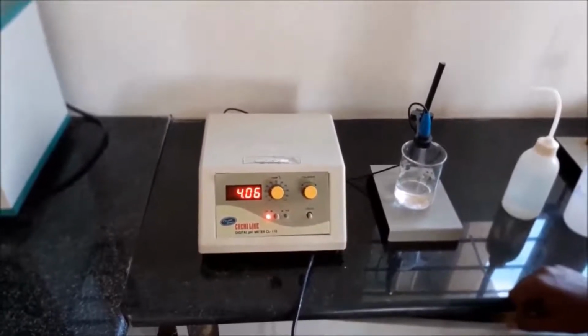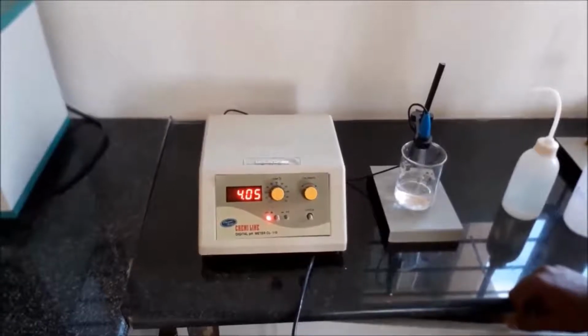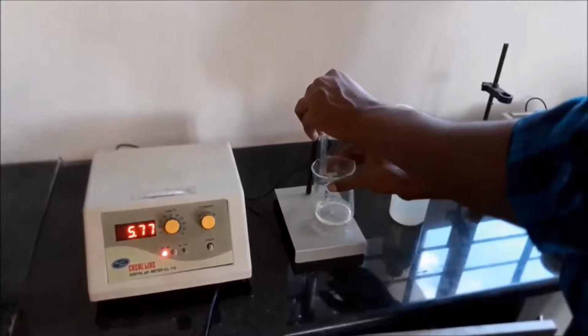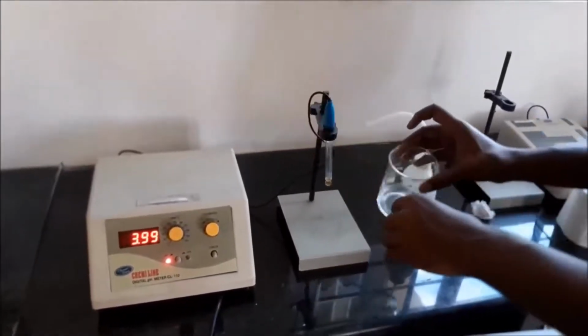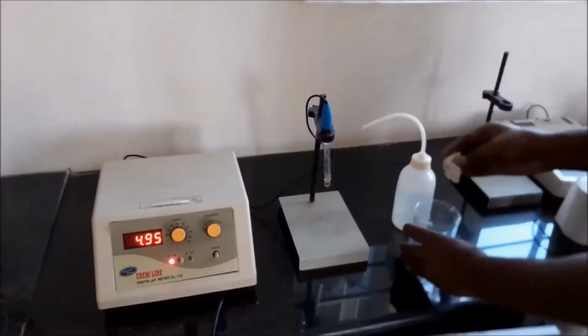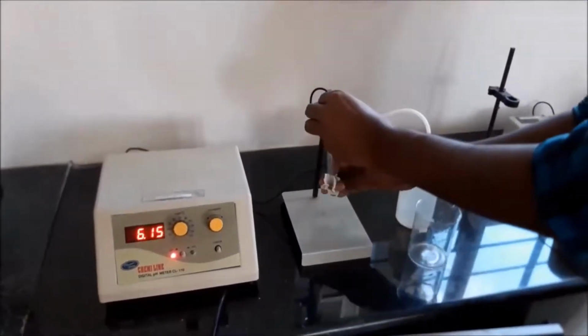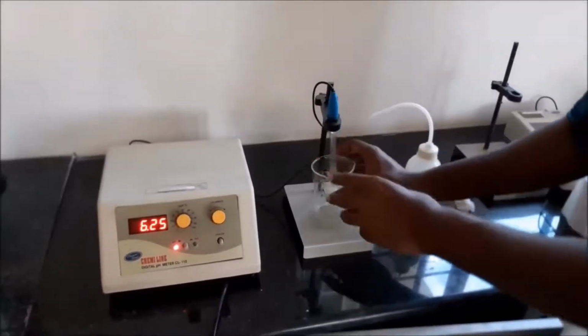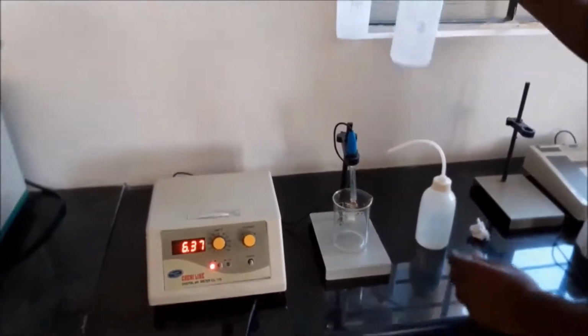So the calibration of the instrument to the value of 4 is complete. Every time the instrument is cleaned with distilled water and the electrode is wiped with tissue paper. Then the instrument is ready for next set of calibration.